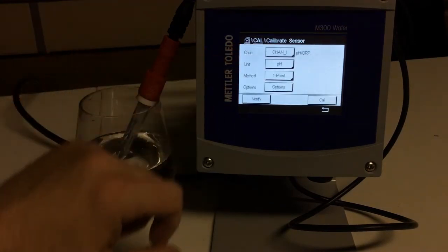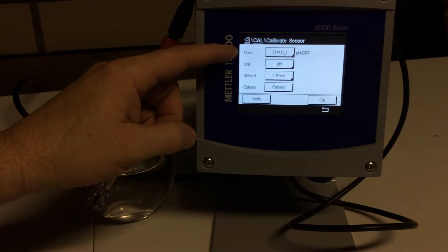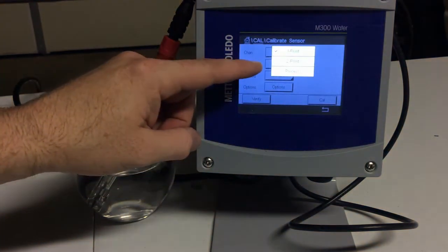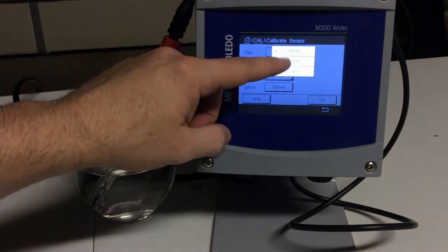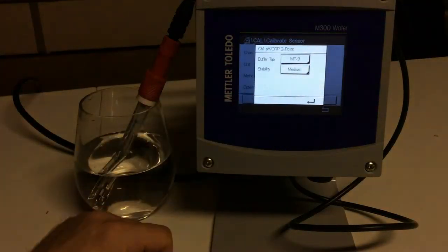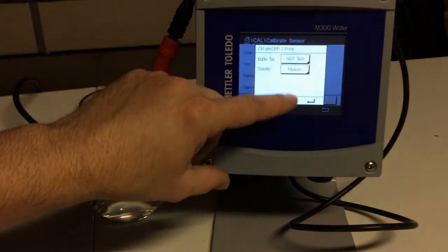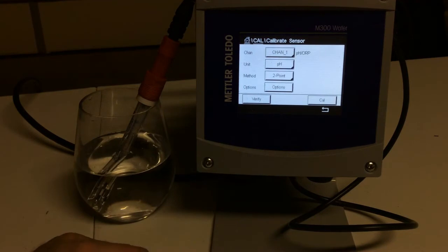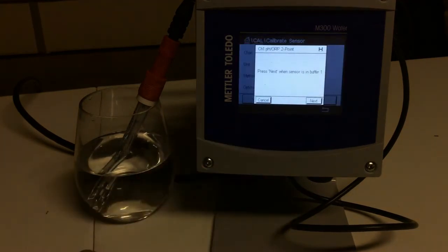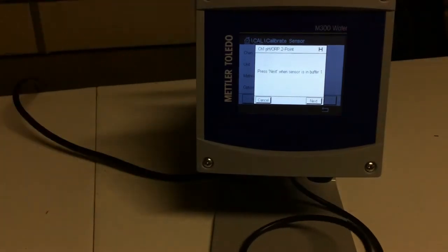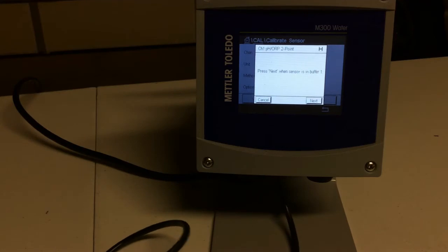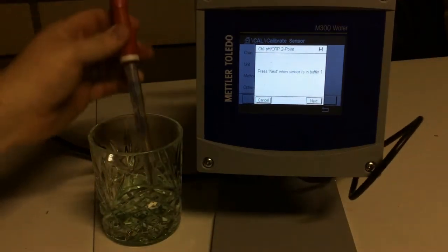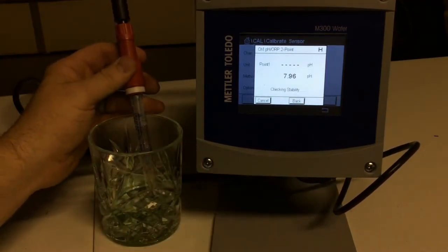So we come here to calibrate sensor. We can see we can select what channel, we can select what unit we want to do. And then we have an option for one-point method, or we can do a two-point, or we can do a process. I want to do a two-point pH calibration. And then my options here is where I can select my buffer tab, so I'm going to come here and select my correct buffer tab, and we're ready to start calibrating. So what we'd do is we'd hit cal, and then it tells you hit next when the sensor's in buffer one. So I'm going to take my sensor, I'm going to clean it off, and then I am going to take it and put it into buffer one.